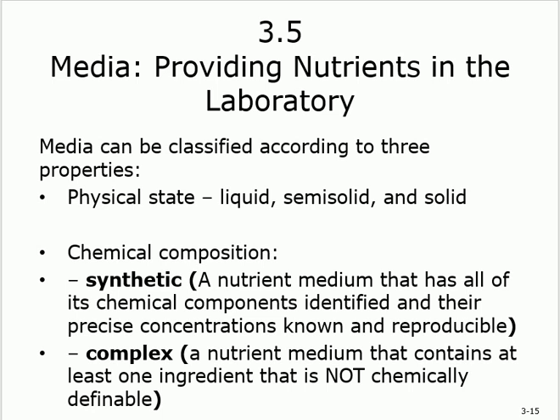The medium, from the physical state, can be liquid, semi-solid, and solid. What's the most common? Liquid and solid. Semi-solid occasionally.